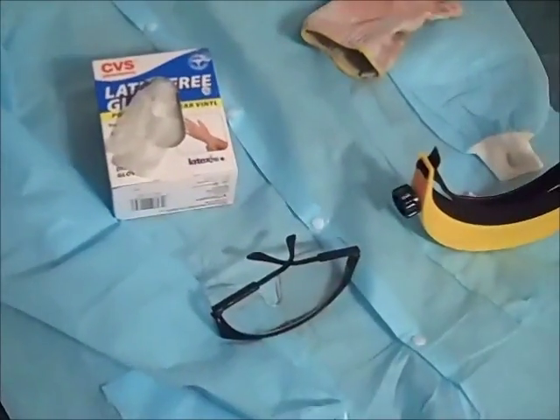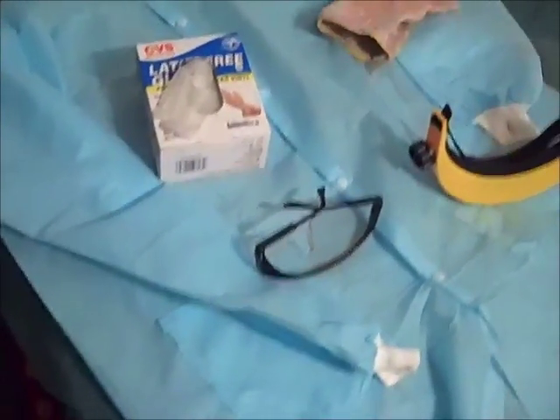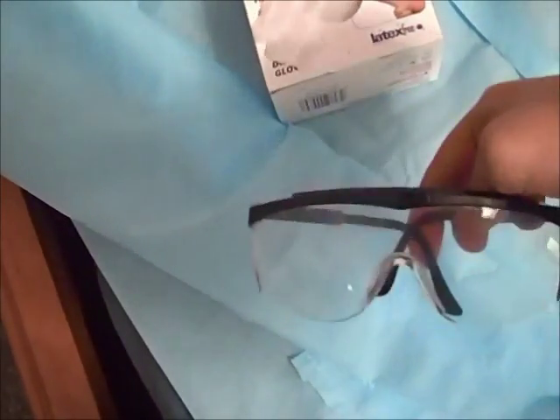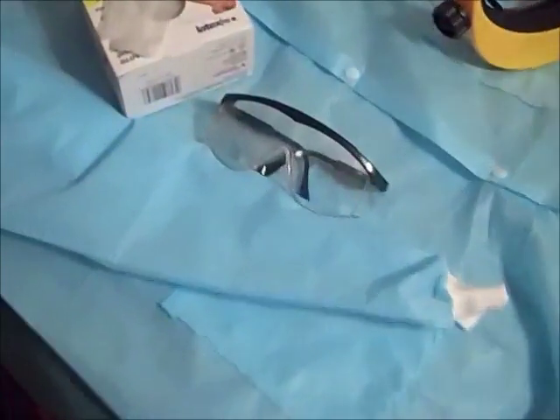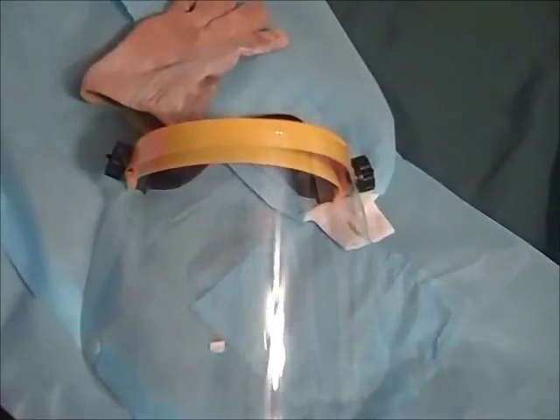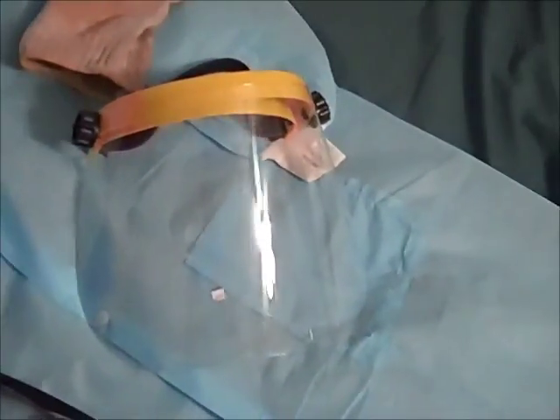Alright, this section of the video is really important so don't gloss over it. This is some safety gear that you will need if you are planning on doing any experimenting. Most important of all is your safety goggles. I plan on upgrading to one that has a head strap around the back. But any type of eyewear will provide some type of protection. Do not do any type of experiment without eyewear. Next is a face shield that I got from Harbor Freight Tools. This is actually really cheap, but I still wouldn't recommend cheaping out on it. Wear it where there is any danger that something can pop out.